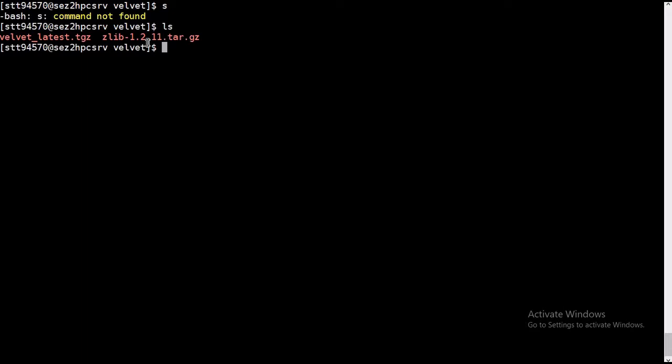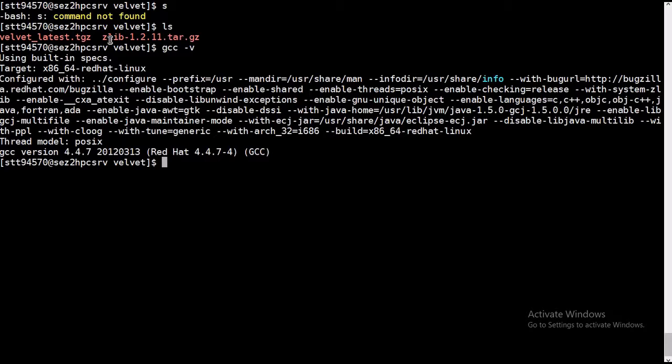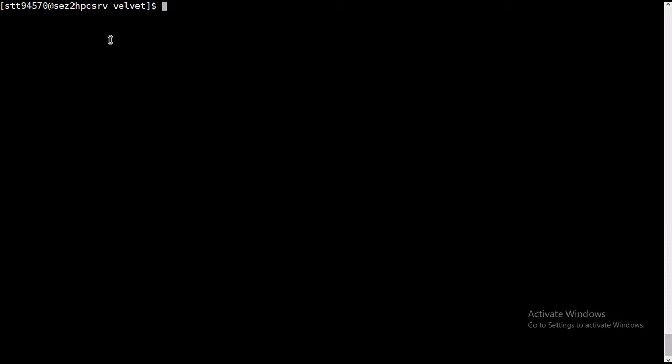Today we are going to install velvet with GCC. First we need Zlib as a dependency, and then velvet itself. We are going to install it with GCC version redhat 4.4.7. Now first we'll install Zlib as a dependency.